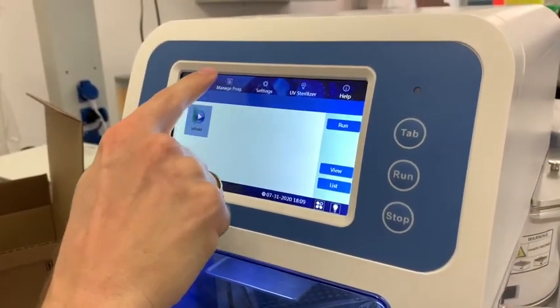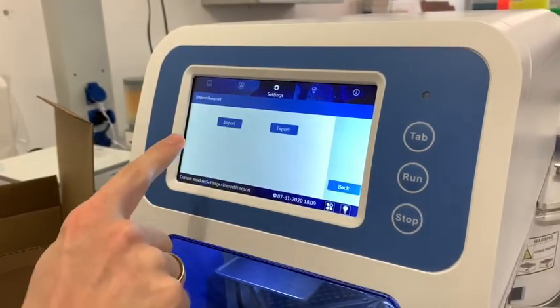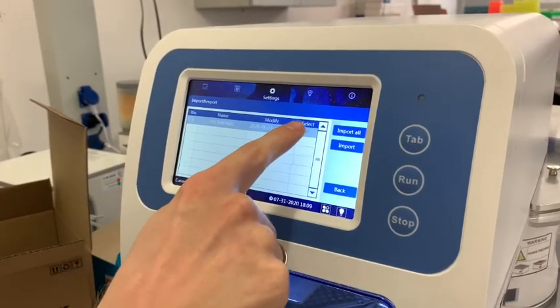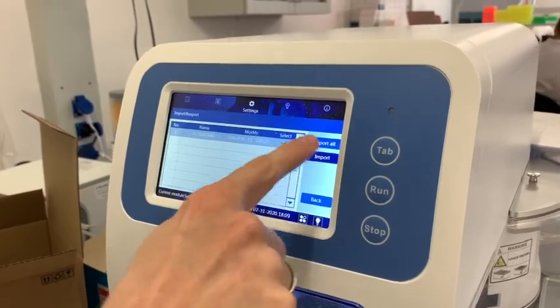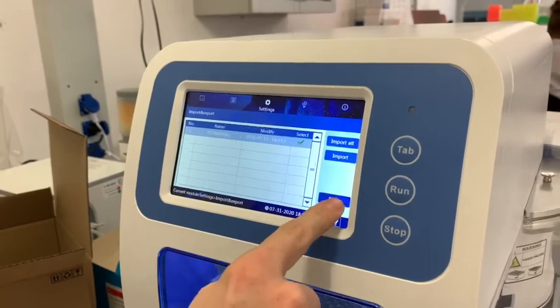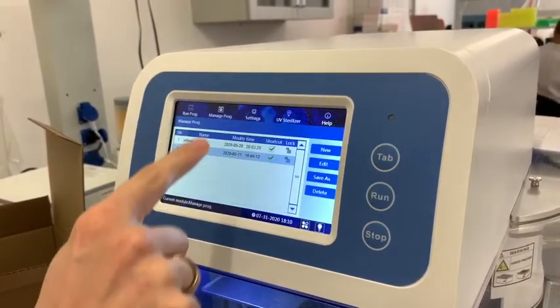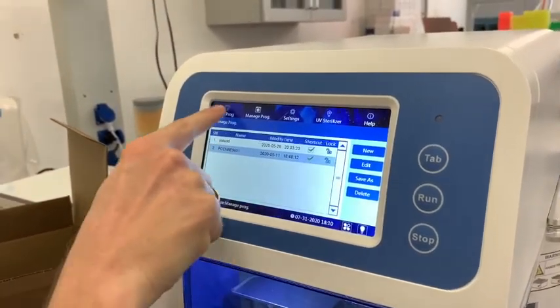Please click on Manage Program, then click on Settings, then Import and Export. Click on Import. Select the file — the green arrow must appear — then click on Import. Then click Back, then click again on Manage Program. You can see the program appeared below. Then go to Run Program, and it is installed.